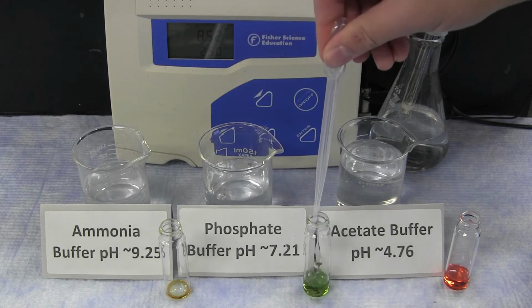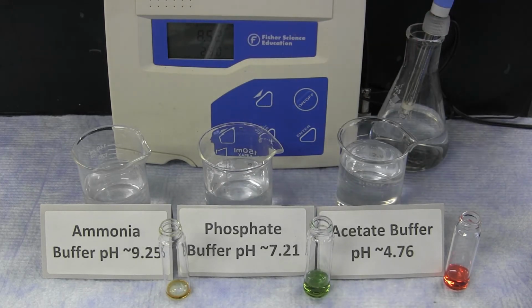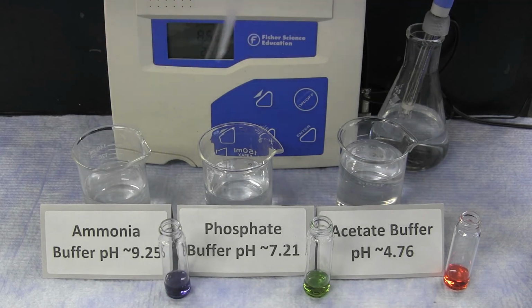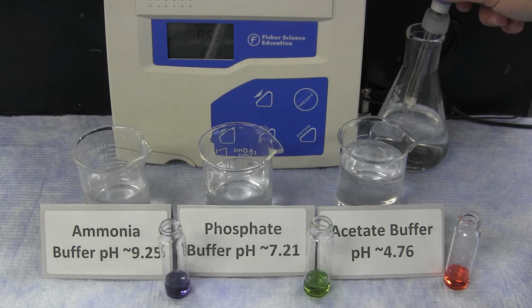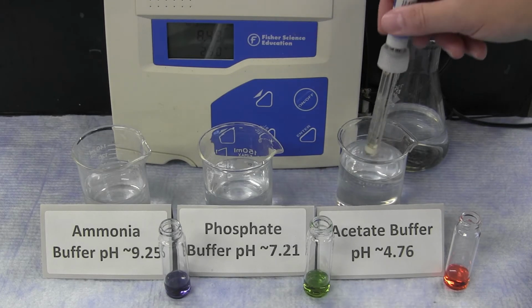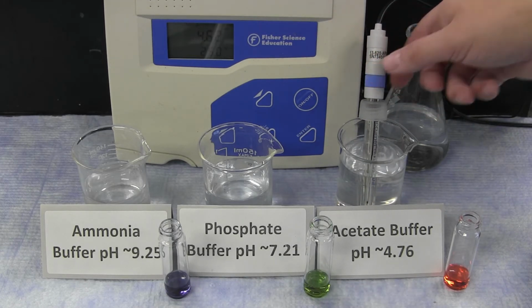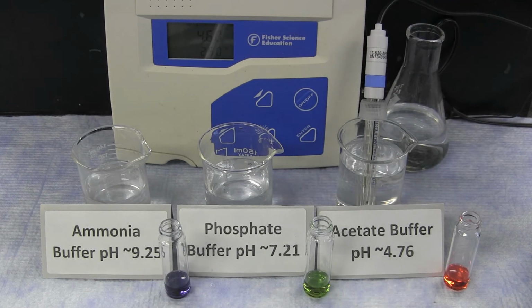With the acetate buffer indicating an acidic pH, the phosphate buffer indicating a neutral pH, and the ammonia buffer indicating a basic pH. These can be measured even further by looking at the specific pH values using a pH meter.